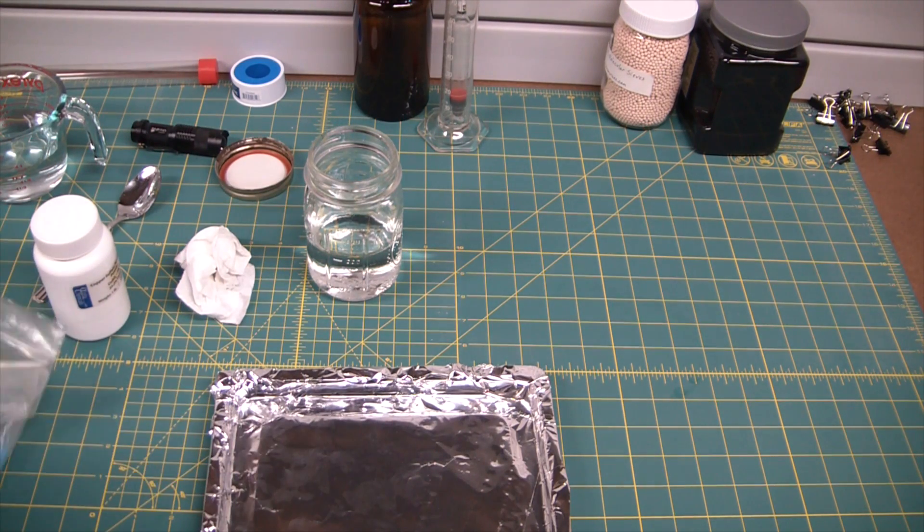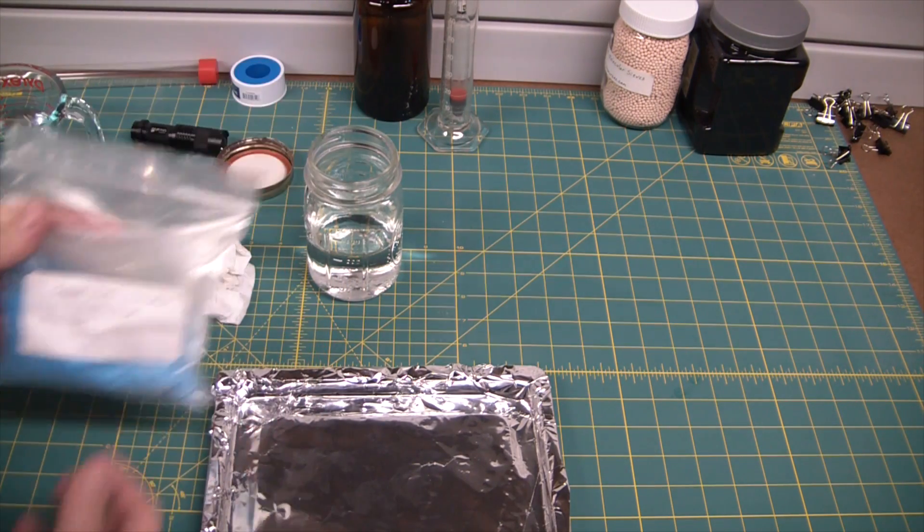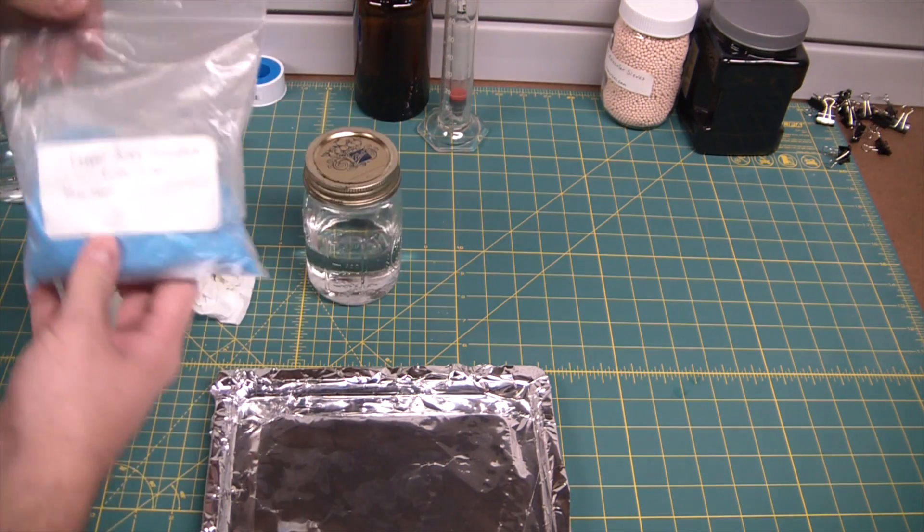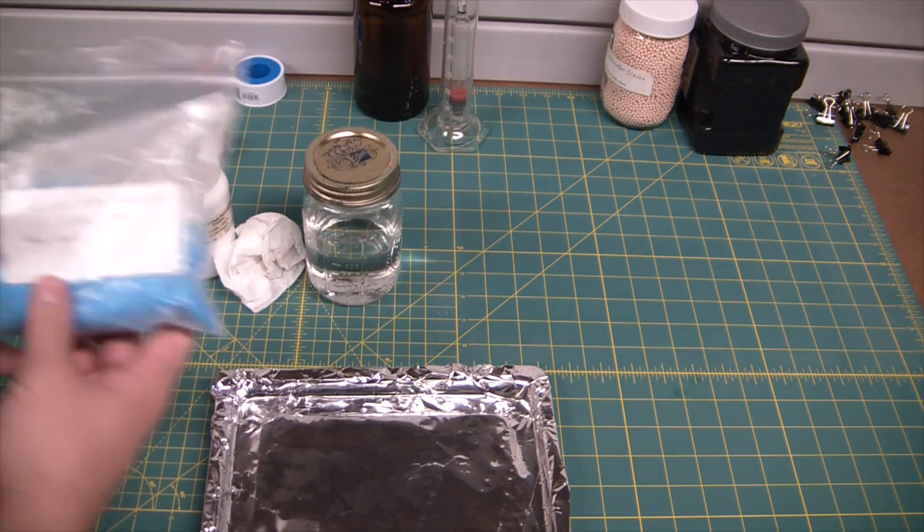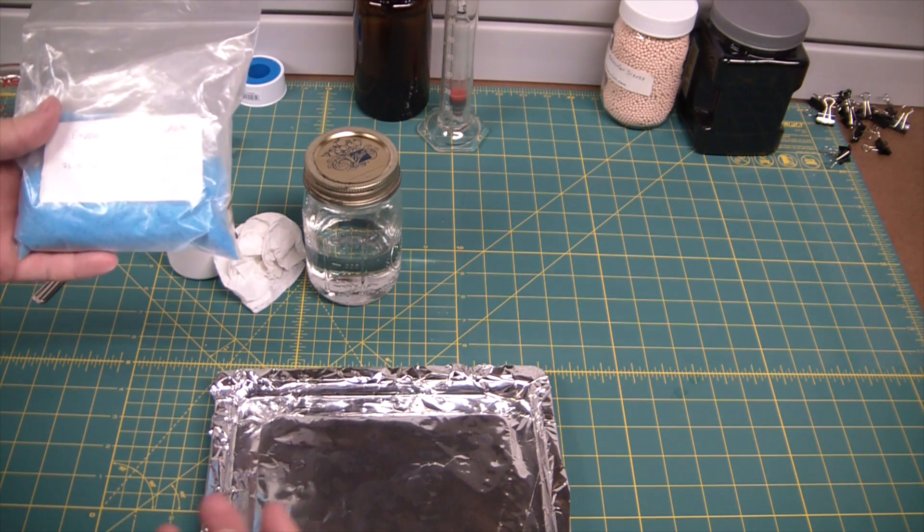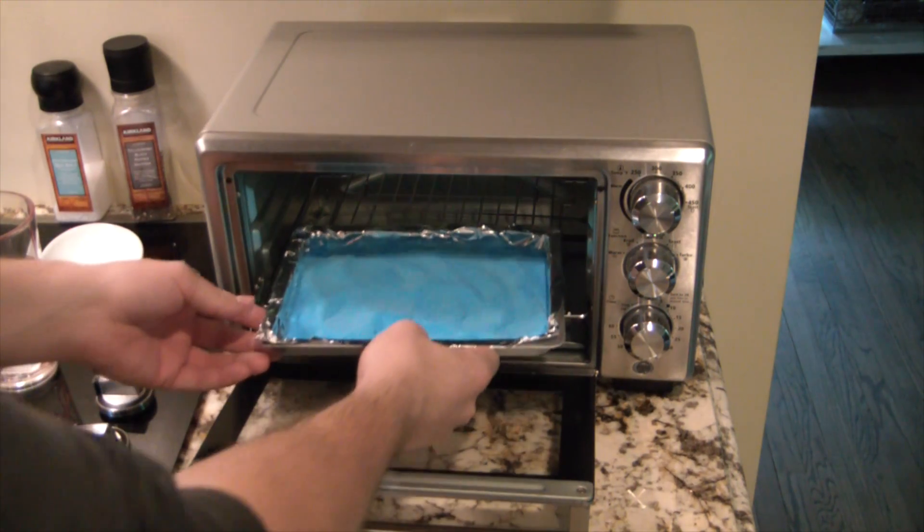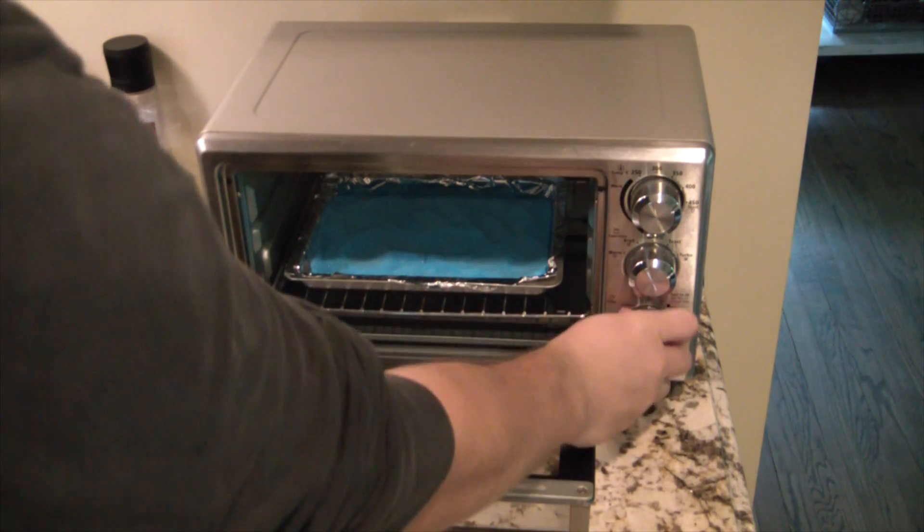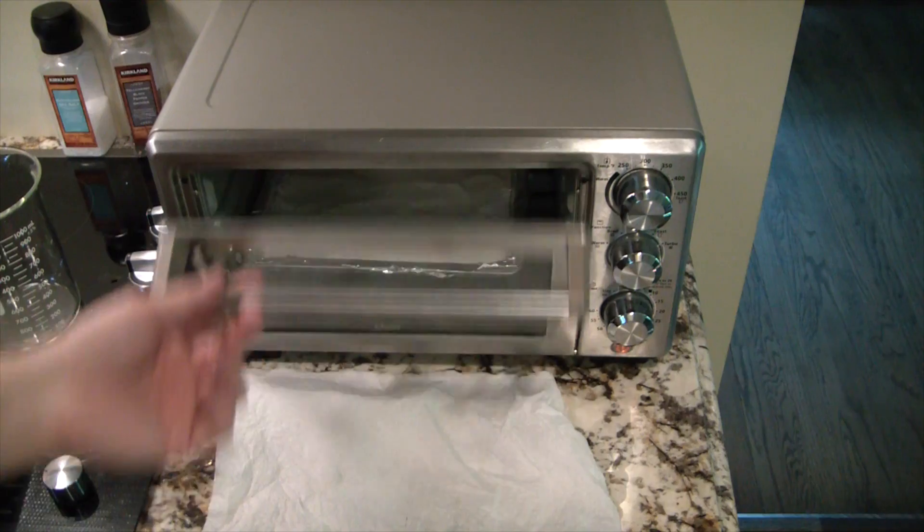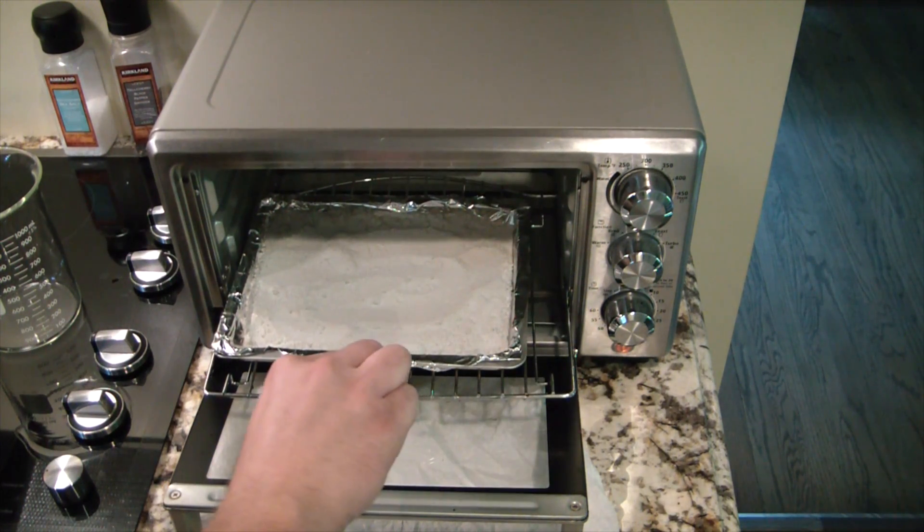But what we can do instead is chemically dehydrate it and suck the water out of it to fully separate it. And to do that I'm gonna be using some copper sulfate, and this is currently pentahydrate. What we're gonna do is borrow the wife's little toaster oven, get this to become anhydrous copper sulfate. So we're gonna basically heat the water out of it, and at that point it's gonna be looking to grab water again very quickly.